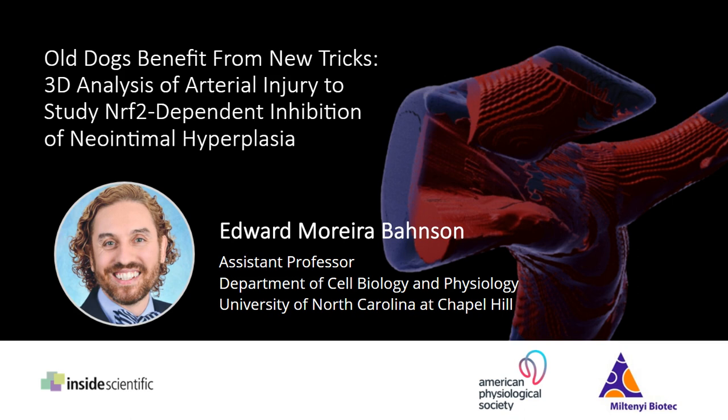Today, Professor Bahnson will be presenting the development and validation of a methodological approach using light sheet fluorescence microscopy for the imaging of preclinical models of vascular injury with a focus on minimizing analysis bias while increasing precision and reproducibility. And with that, I'm very pleased to hand things over to Professor Edward Bahnson. Professor Bahnson, thanks so much for joining us today, and the floor is yours whenever you're ready.